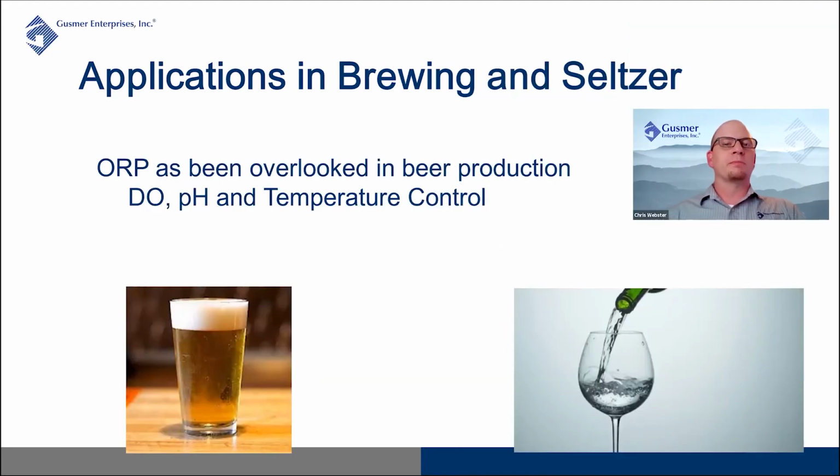So really, why has ORP been mostly overlooked in the brewing and seltzer market? That's due to brewers having become incredibly adept at using other process parameters to improve their product. They use DO, pH adjustments of their mash, and temperature control. They can use these to a high degree to provide a very consistent, repeatable product. But it is important to mention they are in fact process parameters. ORP is simply another process parameter. With DO, pH, and temperature, ORP is reflected in each of those changes. So while brewers have not technically been using ORP as a direct measure, they have been monitoring ORP through the sum of some of these other process parameters.